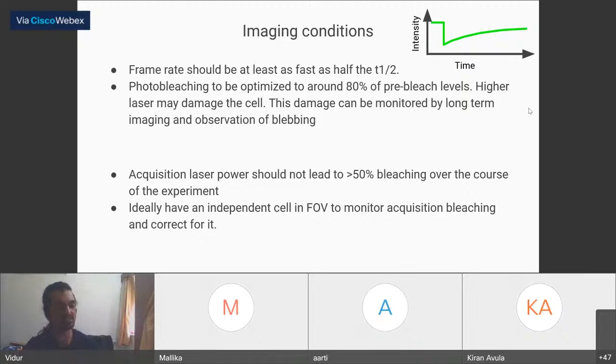The second part, which is if the organelle is sub-resolution and you cannot resolve it, then you can't assess dynamics of that organelle. But what you can assess is recovery or interaction of any protein with that organelle. So let's say if a protein is bound to that particular organelle, based on photobleaching, you can see how much of it recovers over time, and thus you can conclude how dynamic a protein is on an organelle. I hope that answers the question.